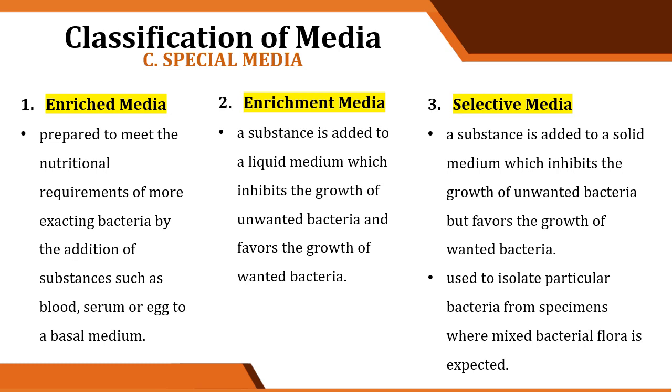So, if enrichment is in liquid, selective is in solid. Actually, they have the same purpose, only the term is different because the type of media is different. The consistency of the media is different. So, if liquid, the term is enrichment. If selective, our medium is solid. Selective media is used to isolate particular bacteria from specimens where mixed bacterial flora is expected.